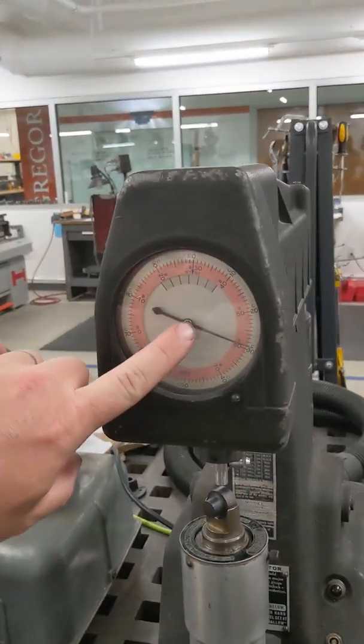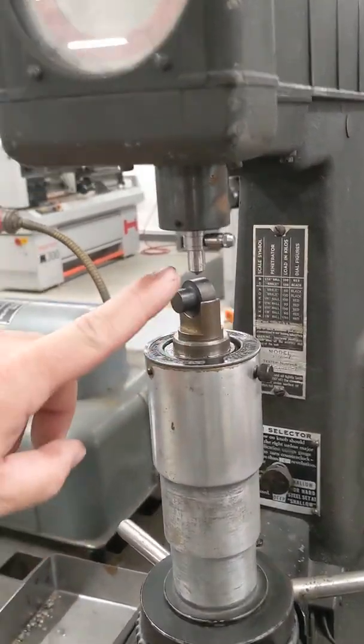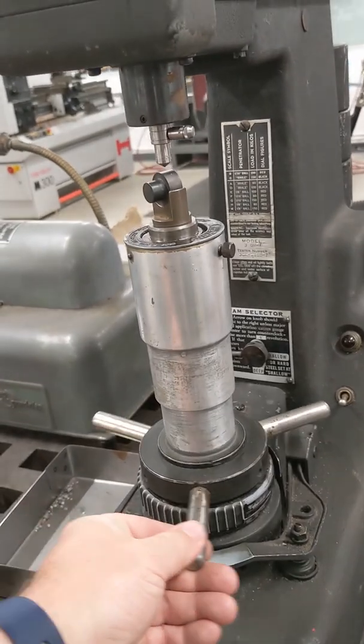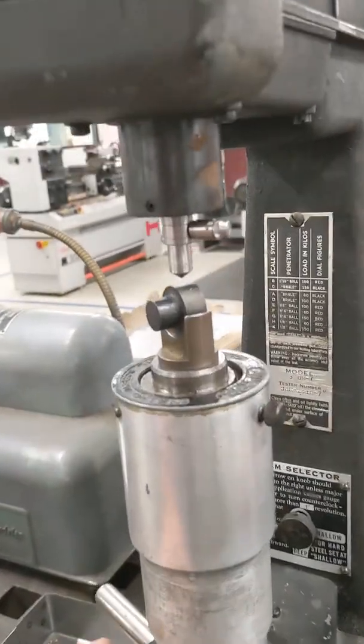The hardness is read off the scale here. In order to move the test sample up and down against the indenter, you rotate this handle at the bottom with the three handles sticking off of it.